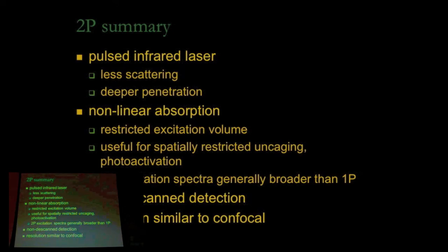So it doesn't increase the resolution. The resolution is similar to what you get with the confocal. Okay, and I'm running long, so I'm thinking I should just leave. I was going to talk about structured illumination microscopy, but I think I'll leave that for another time. Sounds good, and we'll put the slides up online as well.